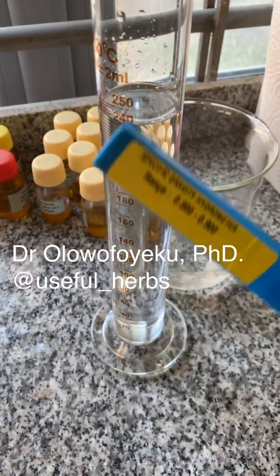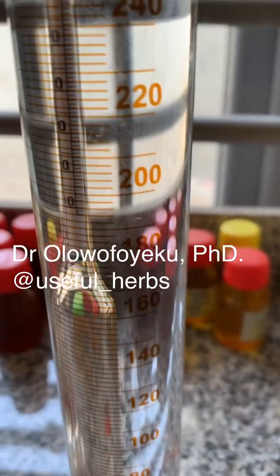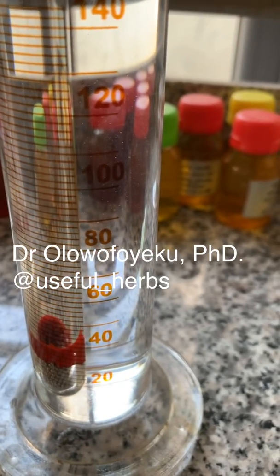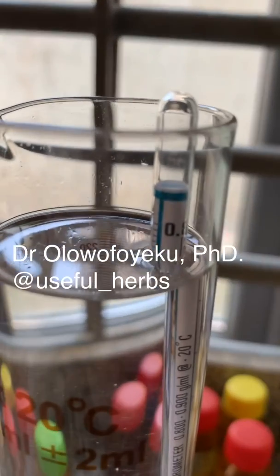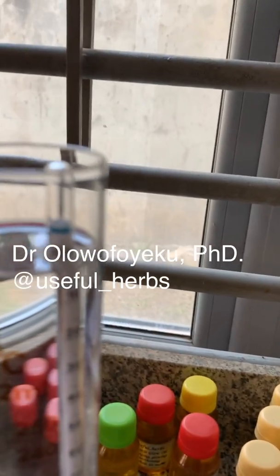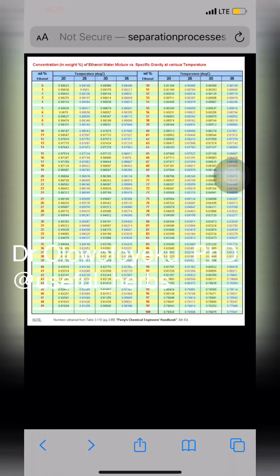That's the hydrometer immersed in 96 percent ethanol right there. You can see that the hydrometer is immersed and floating in the liquid like that. When it stops moving up and down, you take your measurement. The specific gravity of 96 percent ethanol is low. You can see the meniscus there — that's where you take your reading.